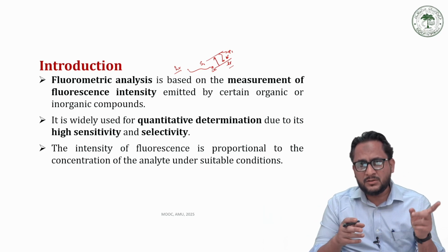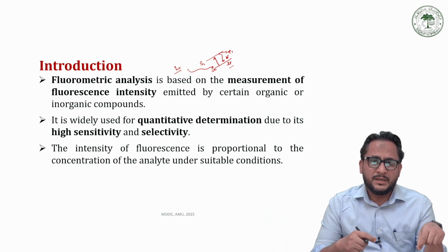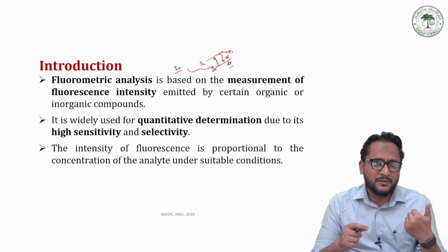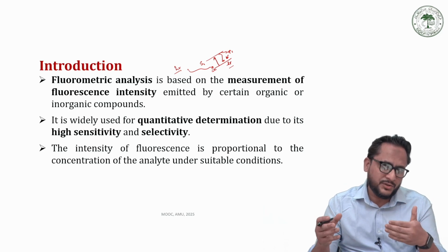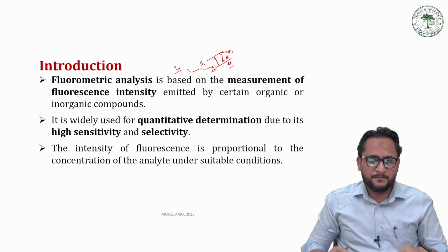One of those methods is called the indirect or derivatization method, in which we attach fluorescent tags or fluorescent dyes, and the second is called the quenching method. In those methods, while doing the analysis, a fluorescent molecule is added and our non-fluorescent analyte attaches to it, and in this way quenching happens. Based on the reduction in intensity we can identify the presence of the analyte, and if it is present we can also identify its concentration based upon the decrease in the intensity of fluorescent radiation.